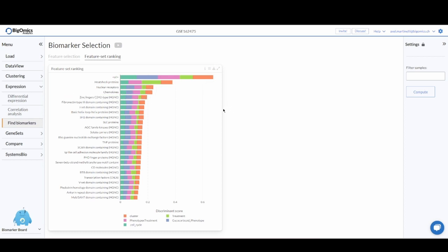This concludes my short introduction on the biomarker selection tab in the Omics Playground platform.